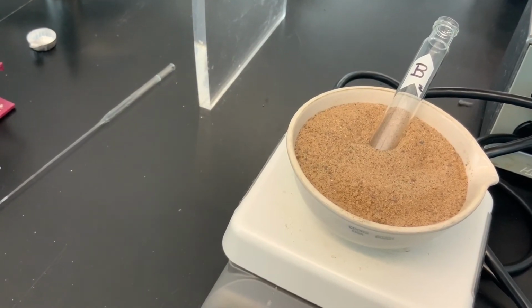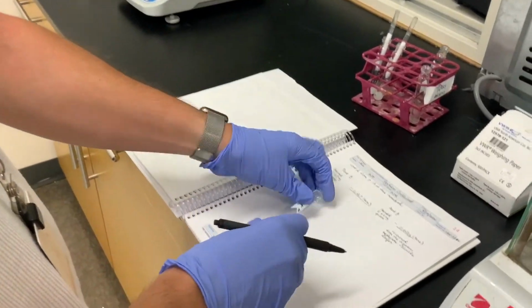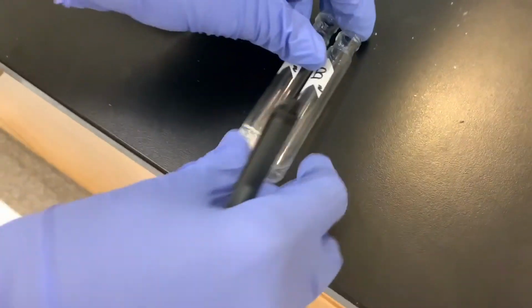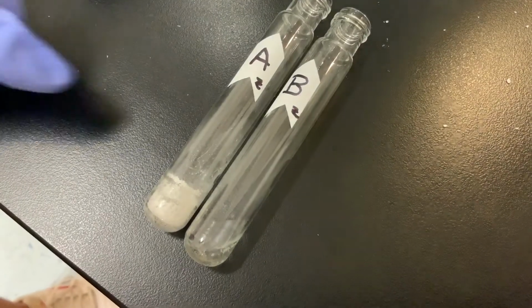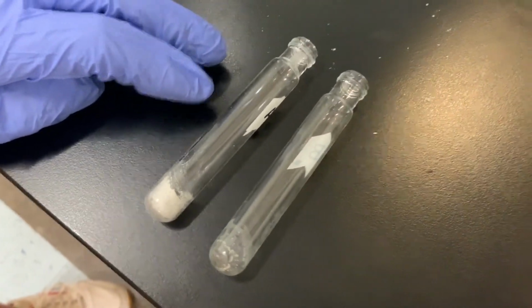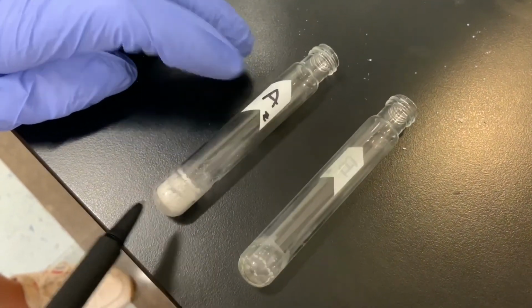So now we've allowed the culture tubes A and B to cool down, and even just upon examination, we see that there's much more solid that was recovered from part A relative to part B. As we're doing this, obviously the methylene chloride boiled off, and we've got a nice white solid here.